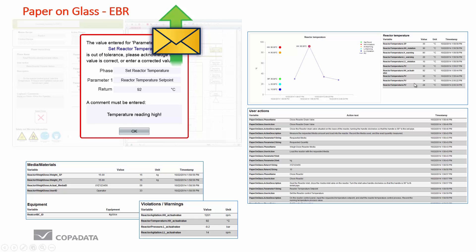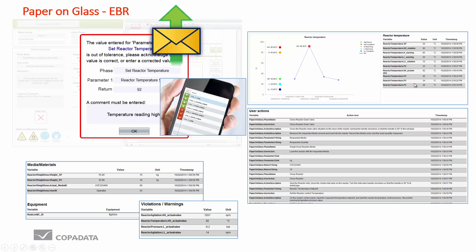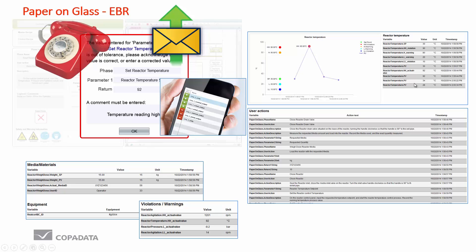We can start to automate the workflows that happen here as well. Automatically when we get a warning or a violation or something's out of tolerance, we can use our message control module to send an email to the relevant people, to send an SMS, or to even call the people which are responsible for that particular task. You can see we can query and alert to the operator, we can automate the workflows to get the quality people involved at the right time, and perhaps we can save the batch before it gets to a critical point which is not possible on a paper system.